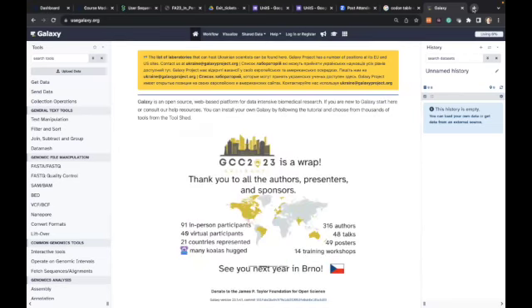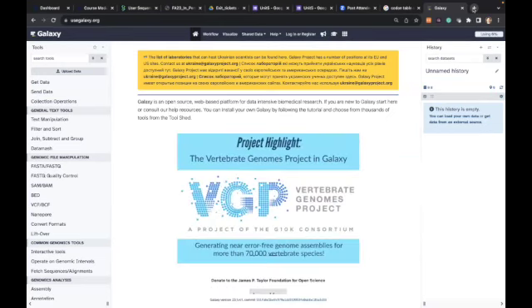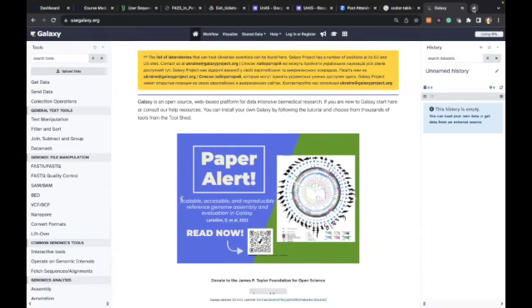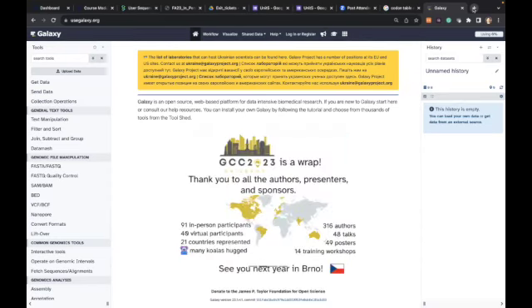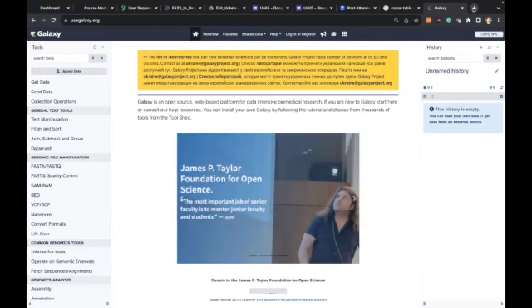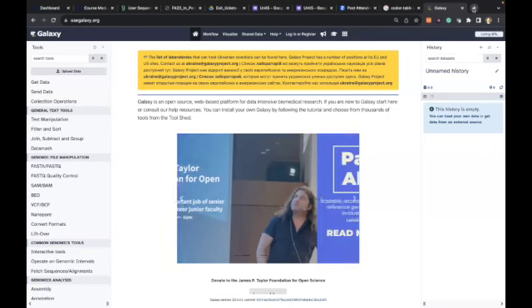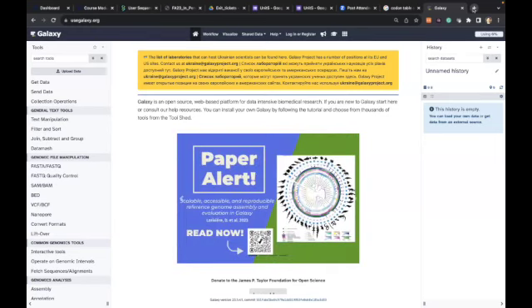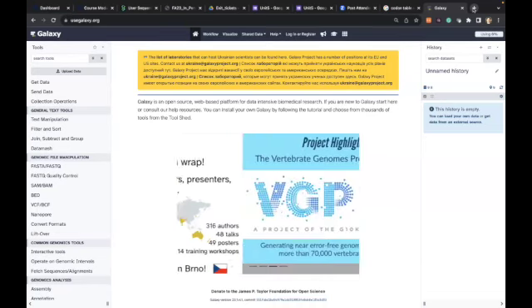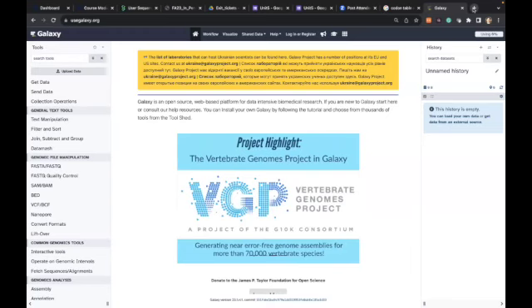So many people found that using the command line is somewhat difficult. Is there any website that already lets us click and access these tools, like software? So here is the website. Each of the menu items is basically Linux software. They gathered so many such free tools, so they named it Galaxy. So that's Galaxy.